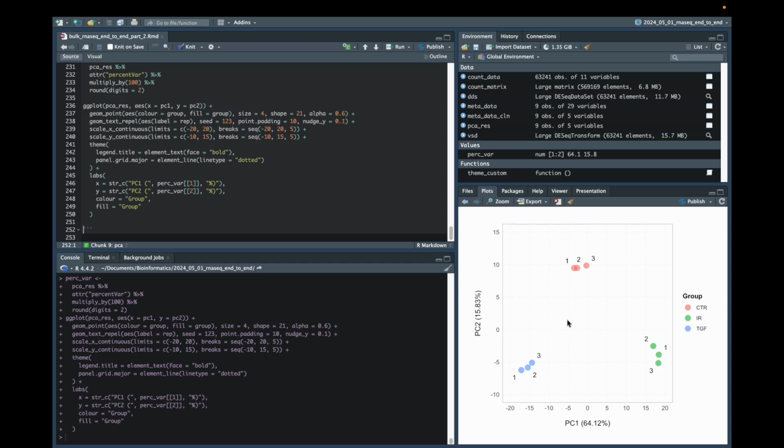So in essence, that's it for today. We've imported RNA-Seq data into R, we've undertaken data transformation, we've conducted exploratory analysis for quality assessment of the data prior to some downstream analysis, and in the next session we'll dive into how to undertake differential expression analysis and adding gene level annotation.